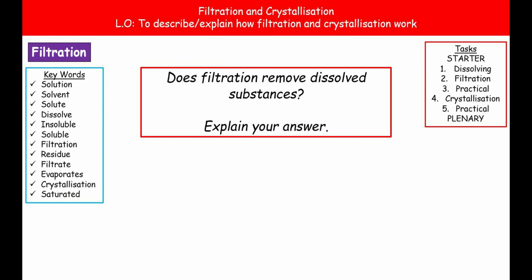So thinking about what we've just said in terms of our filtration process, have a go at answering the question on the screen. Does filtration remove dissolved substances? And explain your answer. So I'll just give you a minute to write down your answers.